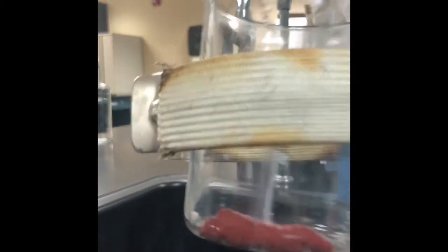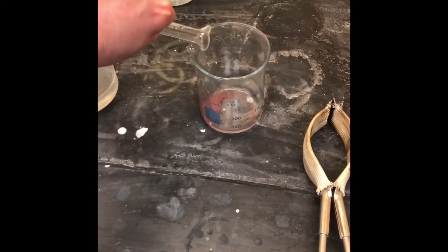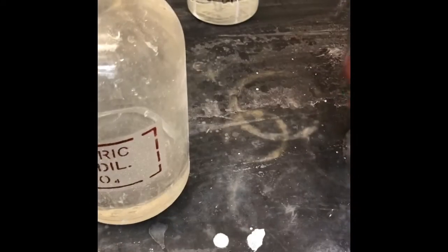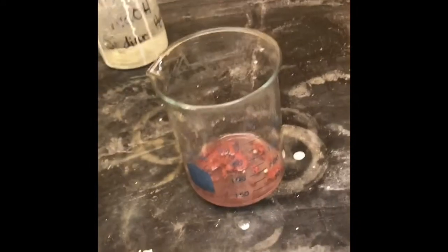See, we're left with this solid right there. Next portion of the lab says we're going to add 5 milliliters of water to our mixture underneath the fume hood. Okay. Swirl around, just make sure we get everything in there.